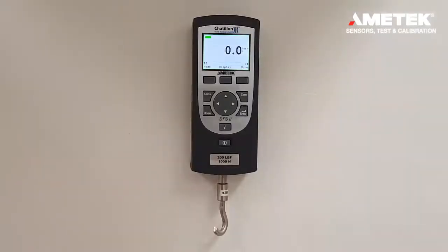From the home screen in normal mode, it is also possible to display the load, the live load, as well as the peaks.